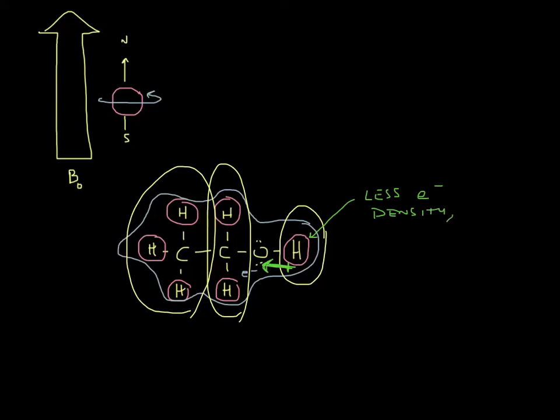So it has less shielding, because those electrons essentially act like force field shields around those protons.